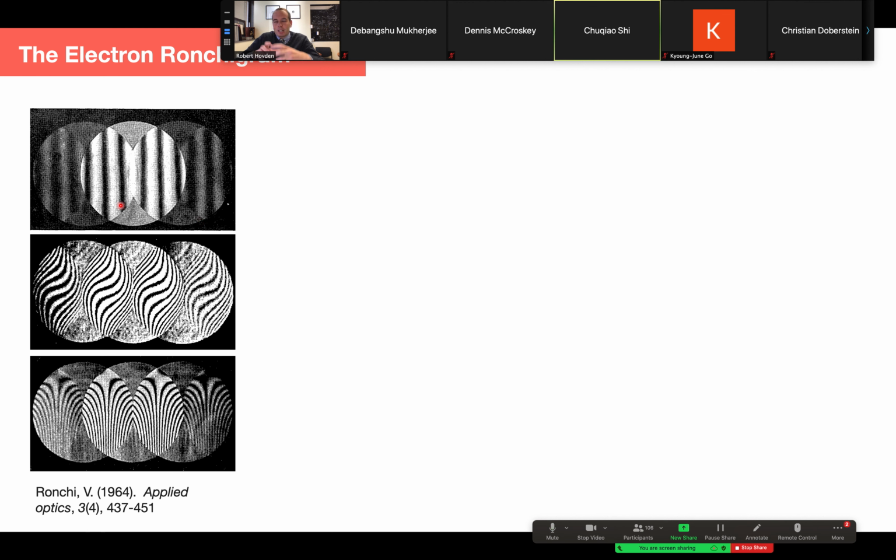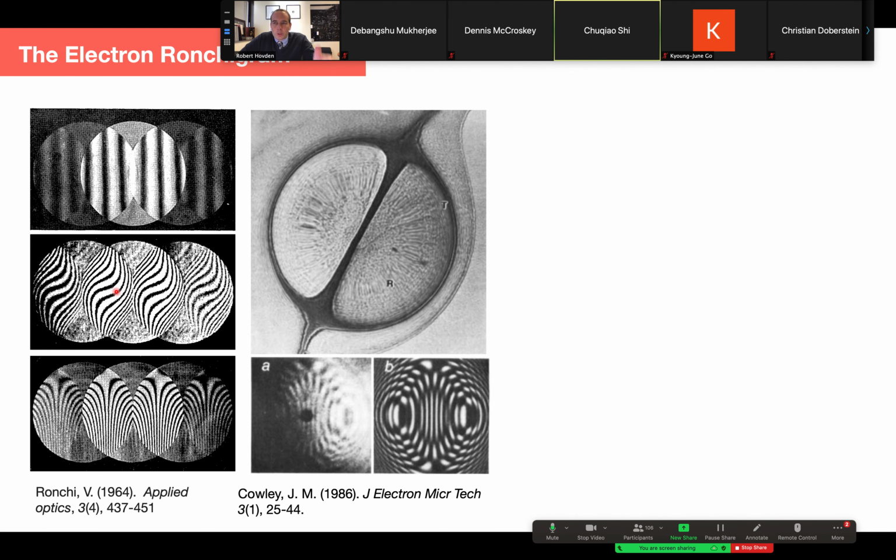Without this grating, a convergent beam diffraction pattern appears as a uniform bright disk. However, if we have this Ronchi grating in place, imperfections in the lens are revealed in these interference patterns here, shown as vertical stripes. So we can assess the quality of the lens based on the shape and structure of these interference patterns. Unfortunately, constructing a Ronchi linear grating isn't possible in an electron microscope.